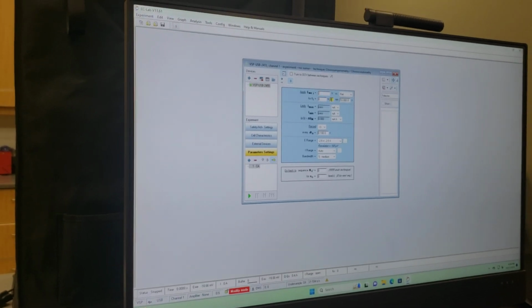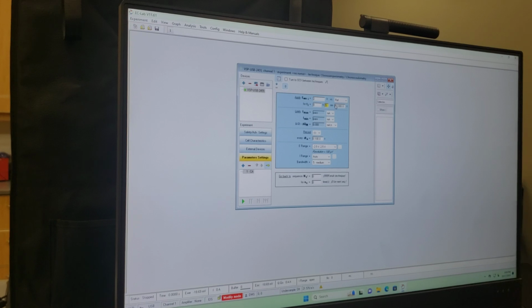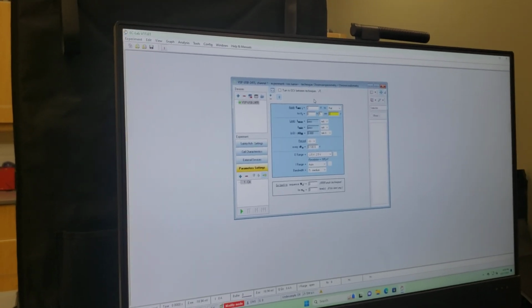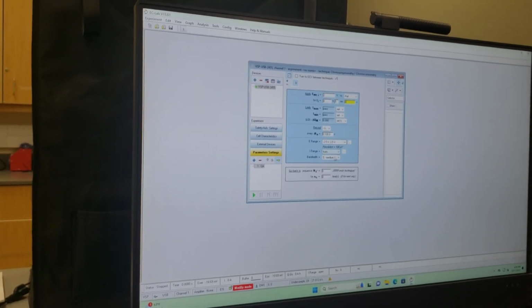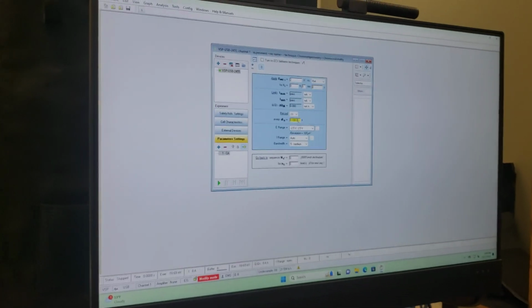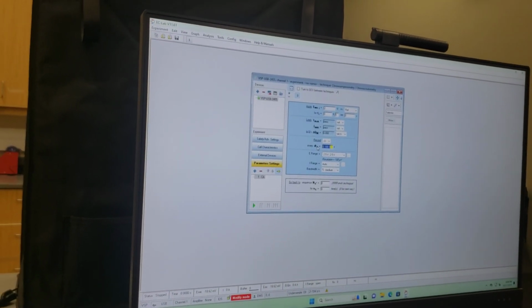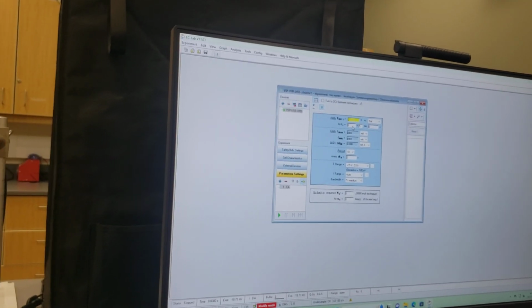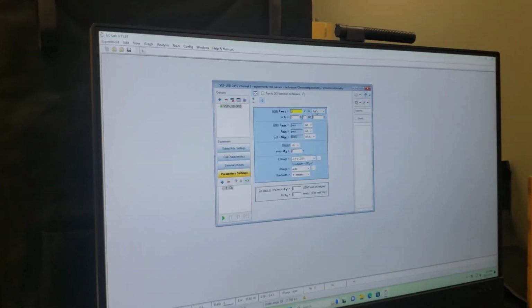All right, we're going to go for 5 minutes. This is hours, this is minutes, this is seconds: 0 seconds. I'm not ready to start, but this is all set and should be okay. Actually, we're going to change this to record every 2 seconds. That's good. 2 volts, 5 minutes, record every 2 seconds, 2 volts versus the reference electrode.